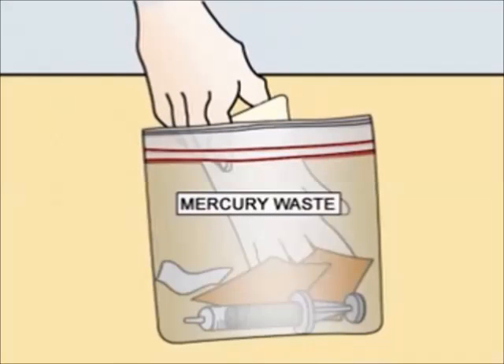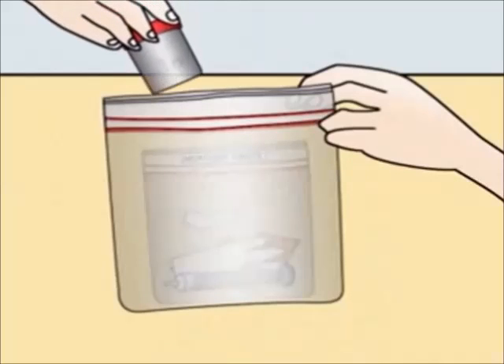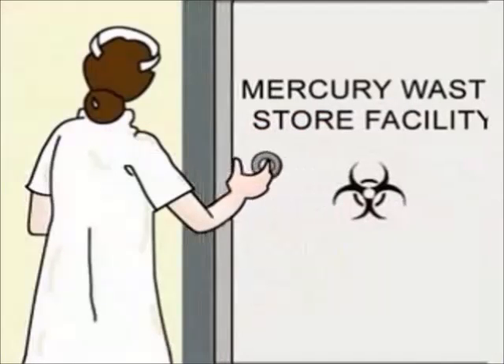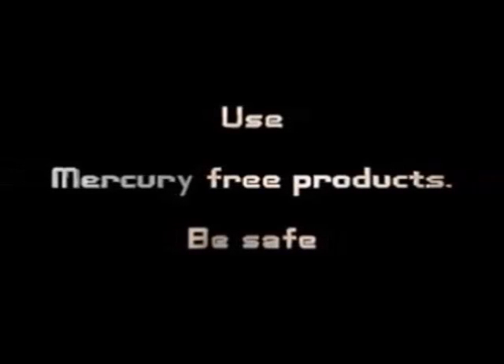Label this bag as mercury waste. Place this bag and the sealed container into another plastic bag and label it also as mercury waste. Store it safely until proper hazardous waste facilities are available in your town. Use mercury-free products — be safe.